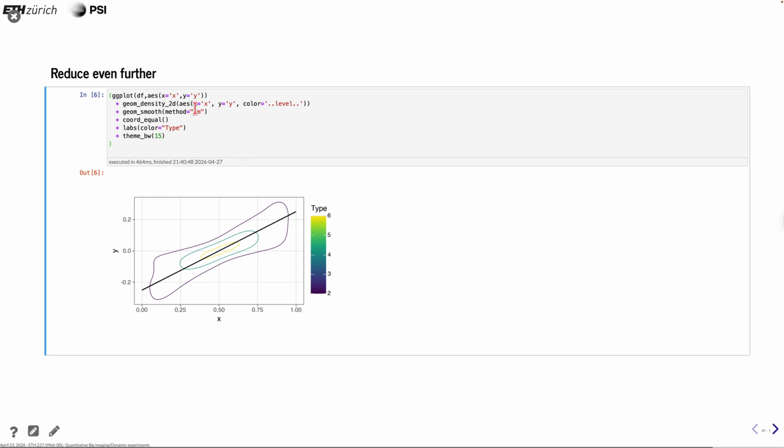Really heavy reduction we can do if we just add this kind of isolines. Again, with the isolines, we can again see that there is an intensity concentration towards the middle around here. This, in my opinion, would probably be a little bit too much reduced, but for some purposes it may be good.